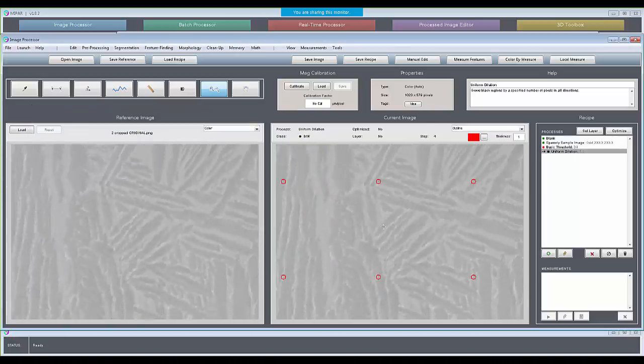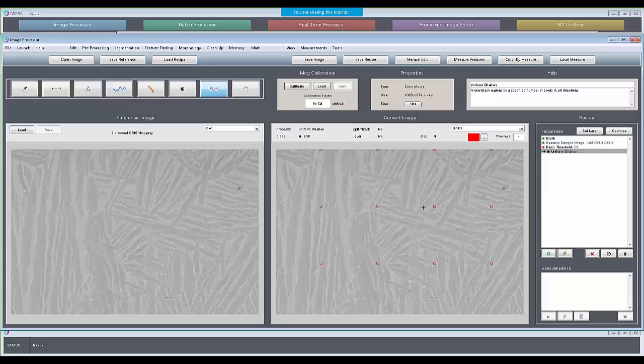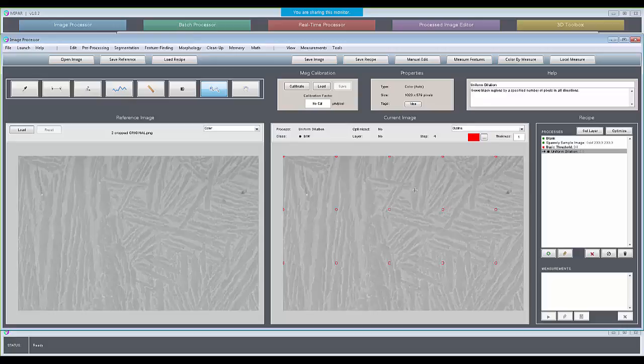So there's a grid now that you've overlaid, and what they would usually do is every time this point would hit a feature, they would count it. If it landed on the edge, they'd count it as half, and if it missed, they'd count it as a miss, a 0. And you could then say the number of hits divided by the number of points is your area fraction. And our understanding is that that worked well with the laws of stereology, because you just do that counting on one image, and you'd recognize that the certainty of that measurement was limited by the number of points that you laid down. In this case, you really could know your area fraction no better than 1 divided by the number of points that you had.